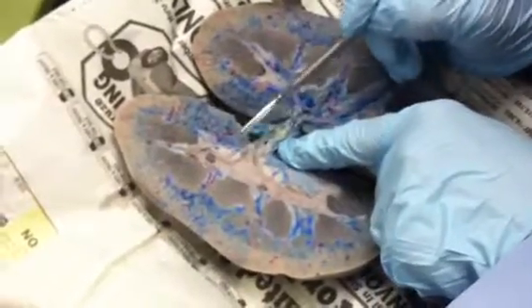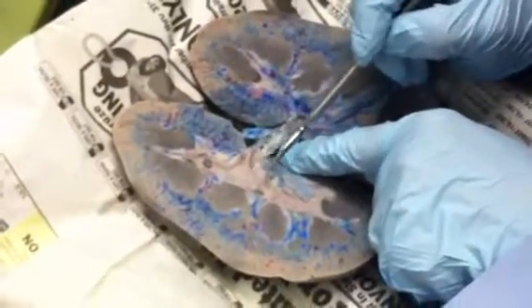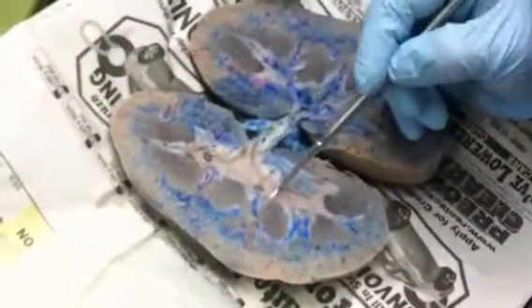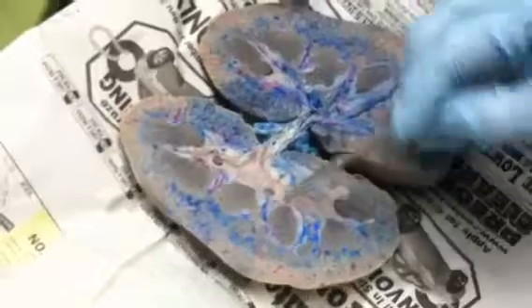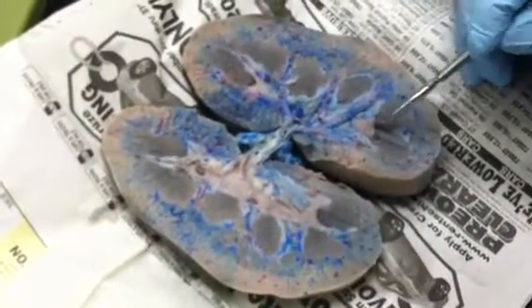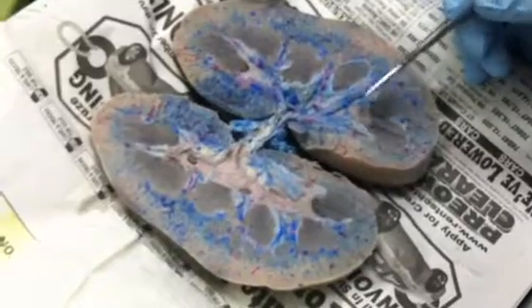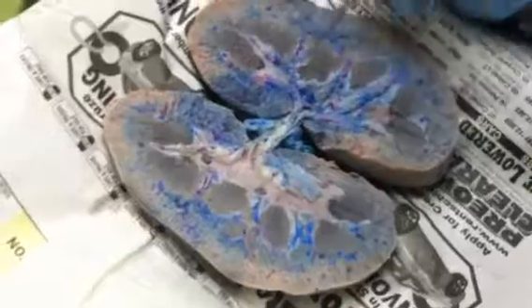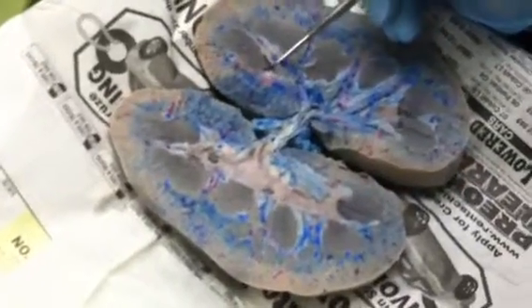So you can see it in the ureter, you can see it in the pelvis, you can see it in the calyx, which surrounds the papilla. And these tips of the pyramids are also papilla. You can kind of see it here. There's a papilla there, and there's a papilla there. This is some more transitional epithelium here. And this is another papilla here.